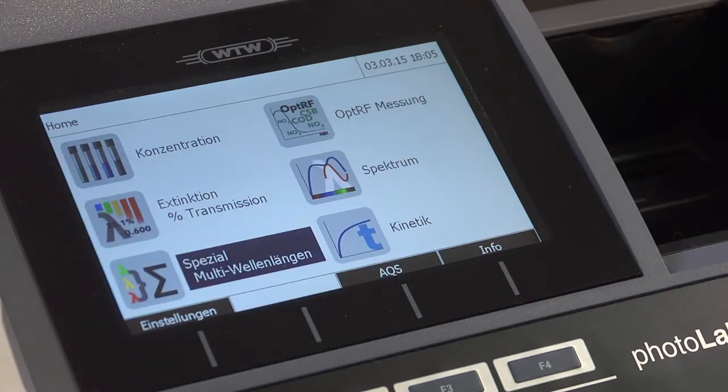Today, spectrophotometers come with pre-programmed methods. User-specific and complex programs can be defined. Today, the devices are simple and versatile in their handling, and even inexperienced users can achieve good results.